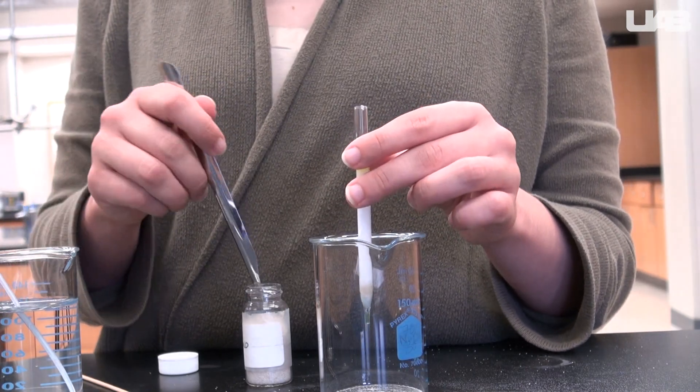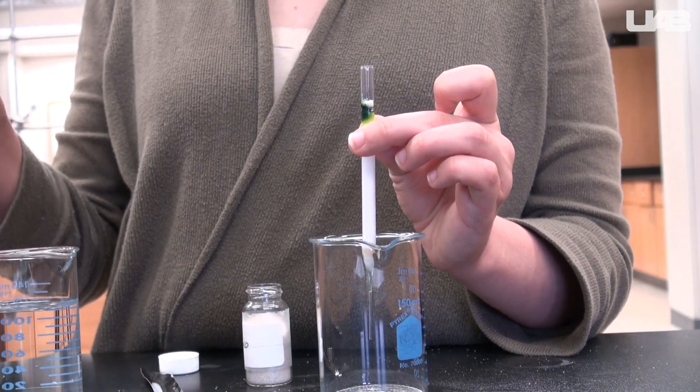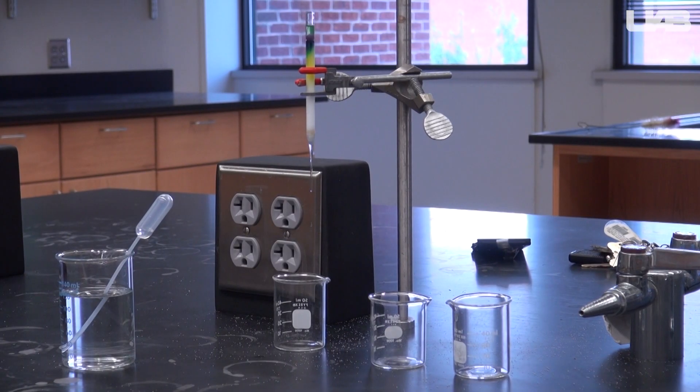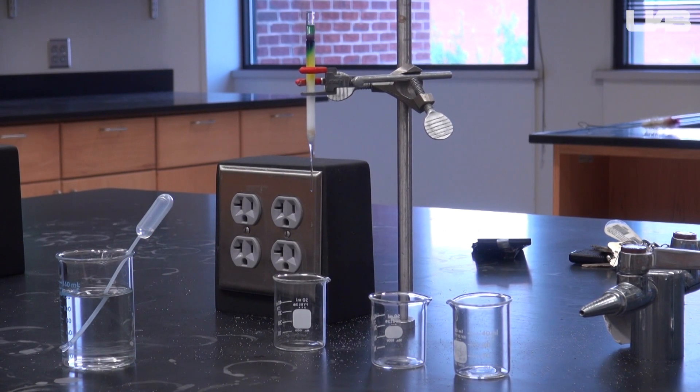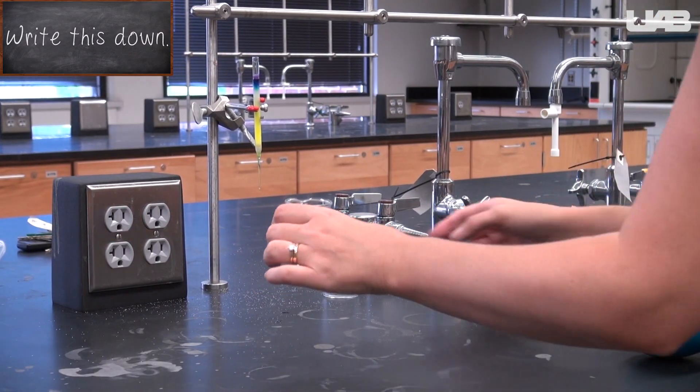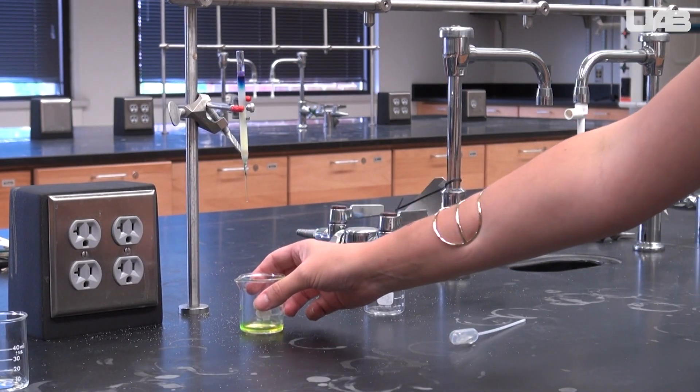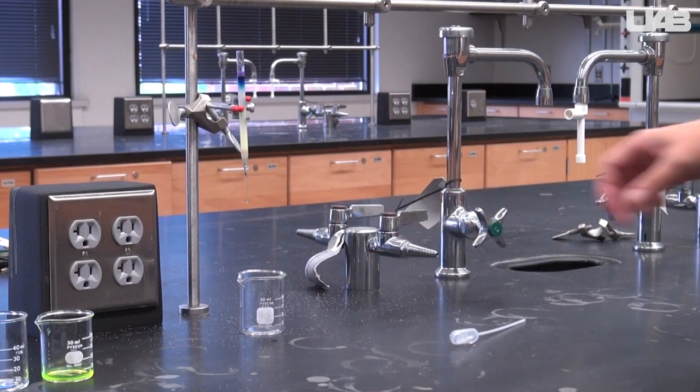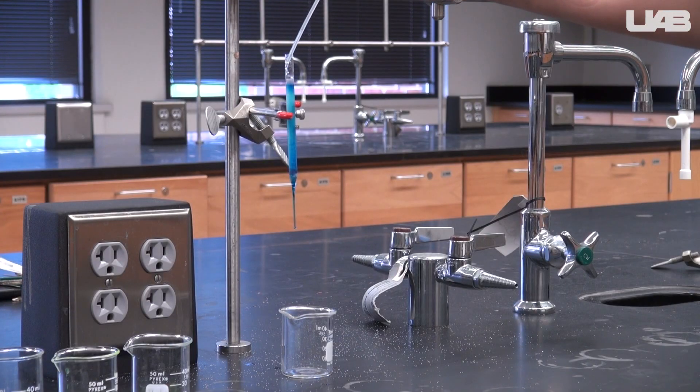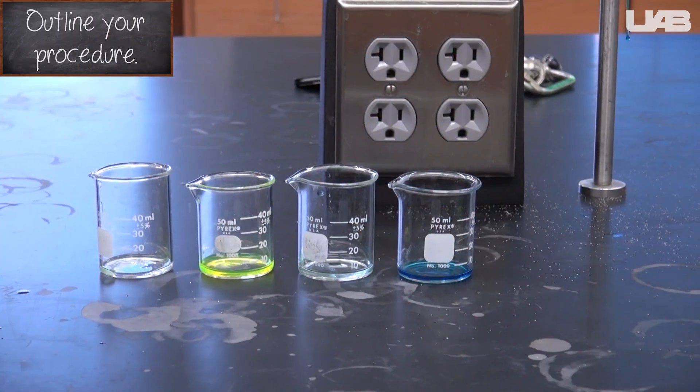Then immediately add a little more sand on top of the silica gel and add some more solvent. At this point, I would recommend calling your TA over just to make sure everything's set up correctly before you continue. If they say it looks okay, continue adding solvent to keep the level above the silica gel and continue to exercise three. At first, the clear colorless solvent will be dripping out of the pipette. You should use a waste beaker to collect this so that it doesn't drip all over the lab bench. Once the colored solution starts to drip out, swap the waste beaker for a clean, dry, 50 milliliter beaker that you will use to collect the first colored solution. Once the drops go back to being colorless, switch back to collecting the drops in the waste beaker. When another color starts to come through, place a new empty beaker underneath the pipette and collect it. Repeat this for each dye that is present. Your lab manual tells you what to do if two colors are eluting at the same time.